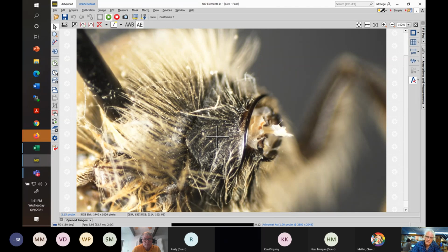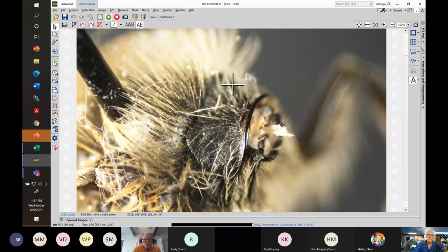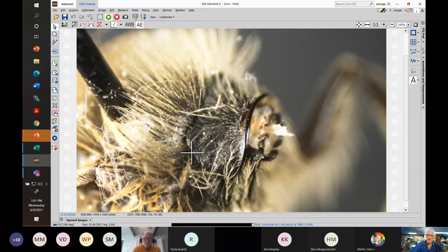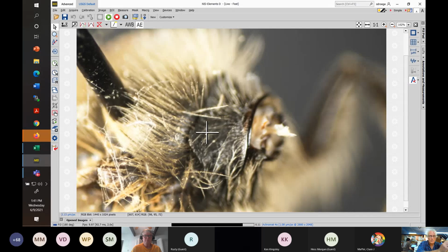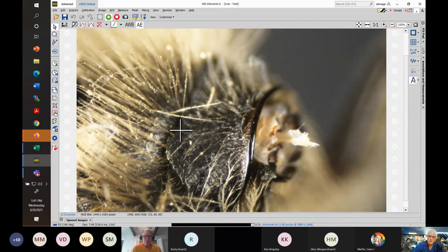So in looking at this, this is pretty good, although of course not perfect. If there were no corners or ridges, then this whole pronotum is basically like a big horse collar. Not that anyone knows what a horse collar is anymore, but it's going to be a smooth shape without any basically projecting features. When you have corners like this one does, let's see if we can get an even more close and see if that's going to be useful. Yeah, I think so.